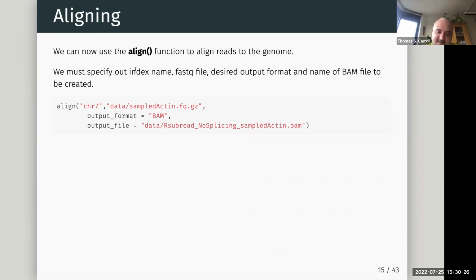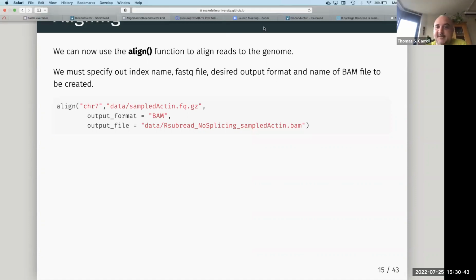So this strategy of aligning to the index is really the first pass. And then given how they're arranged, if it's a splice-aware aligner, is there a splicing between them? It will then try and fill in the remaining subreads of that read.